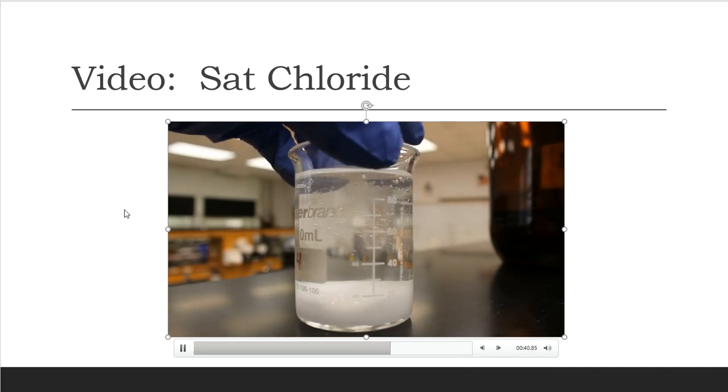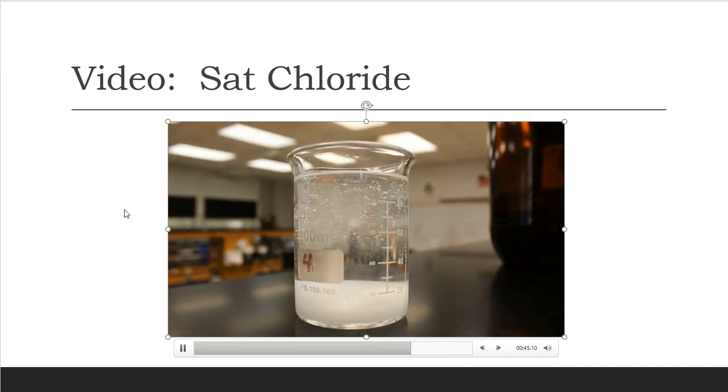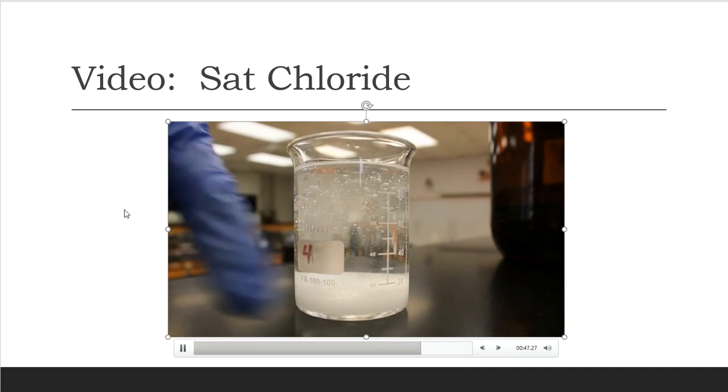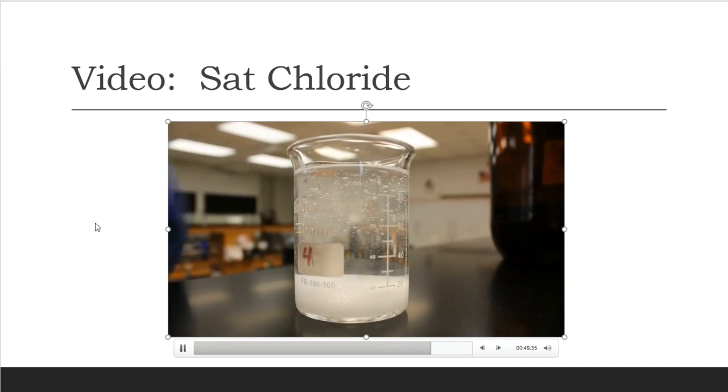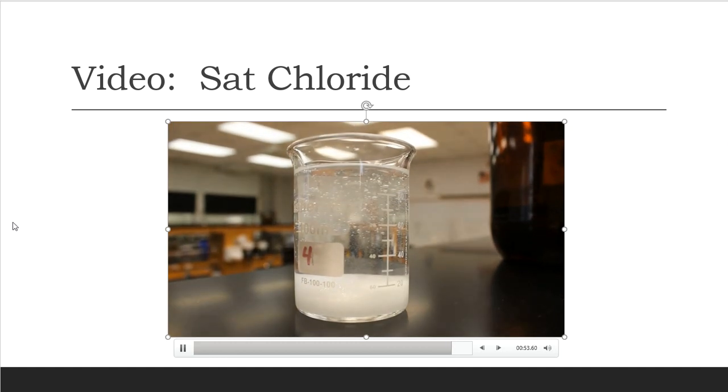All right, so this is my saturated solution. I know it's saturated because no more salt is dissolving in the very bottom of this beaker. So I'm going to use only the liquid on top for my washing that's required for the next step of the Markovnikov addition.